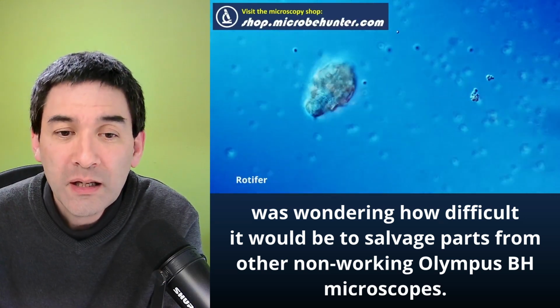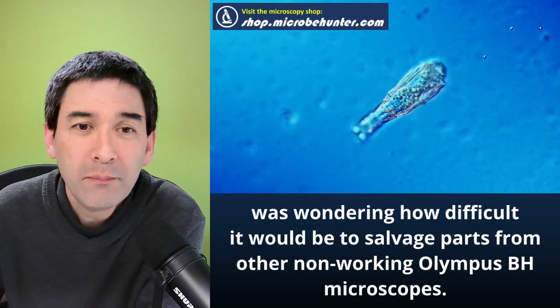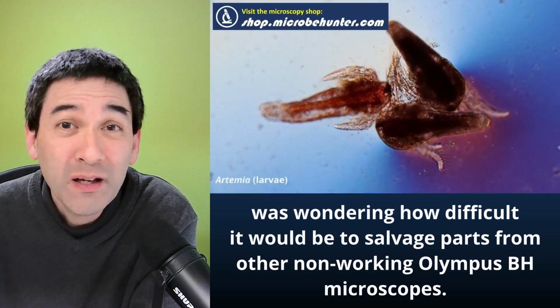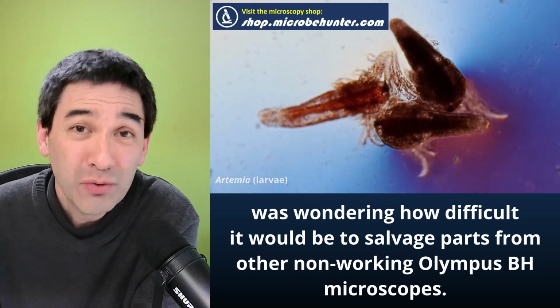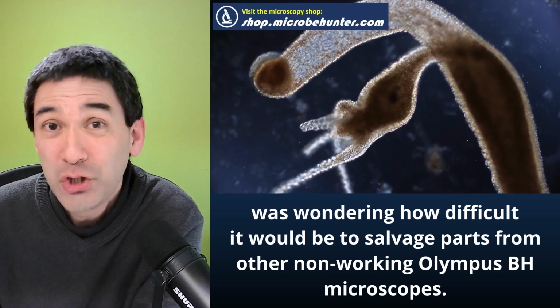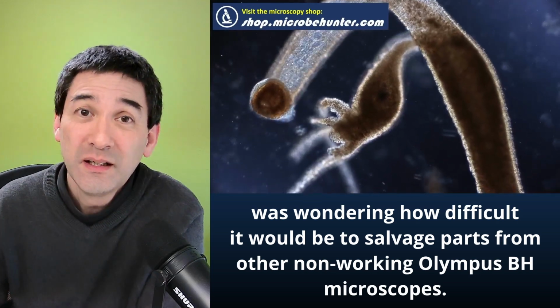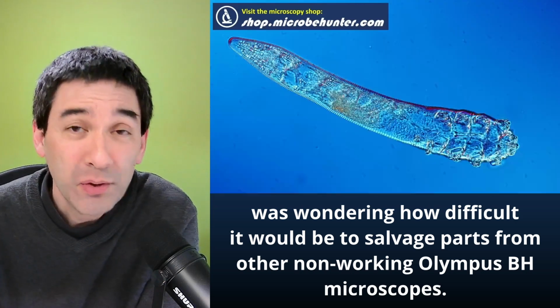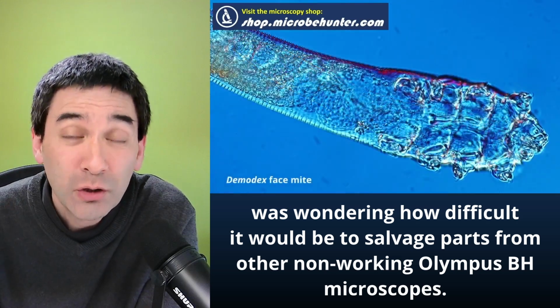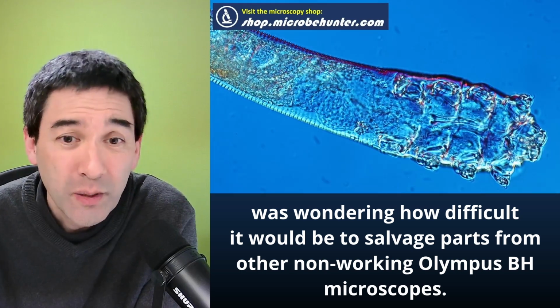Now, I know someone who emailed me several years ago who was able to convert a BH2 microscope to DIC, differential interference contrast microscopy. This did cost several thousand euros, even though all of the parts were second-hand, but it was still cheaper than buying it new. But you have to understand that those are highly specific parts, which might be a little difficult to get and which were not manufactured in such large quantities. So depending on what you want, it might not be quite as cheap.